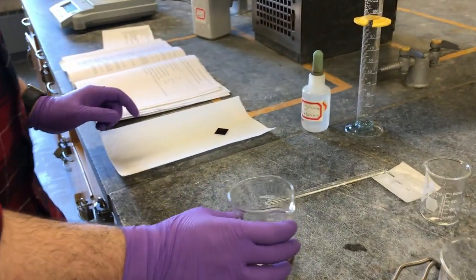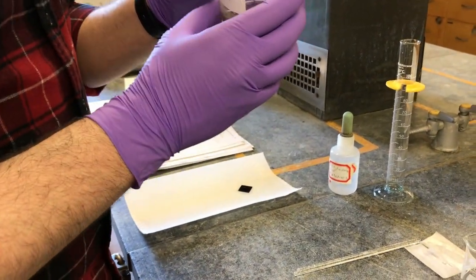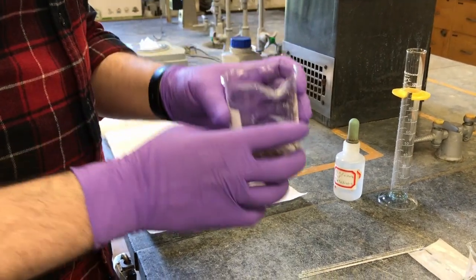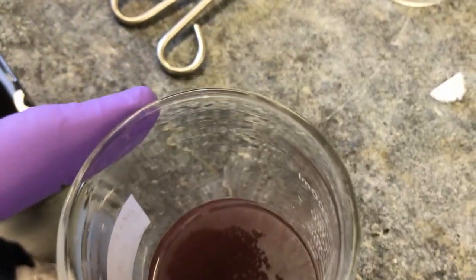Can you get that stuff off the edges of the beaker, maybe with your stir rod? You got that residue on the sides. Oh, like all this stuff? Yeah. This is just dried copper chloride. There's a little bit left, but it's an insignificant amount. Okay. So as you can see, we have a lot of distinct chunks of our copper.